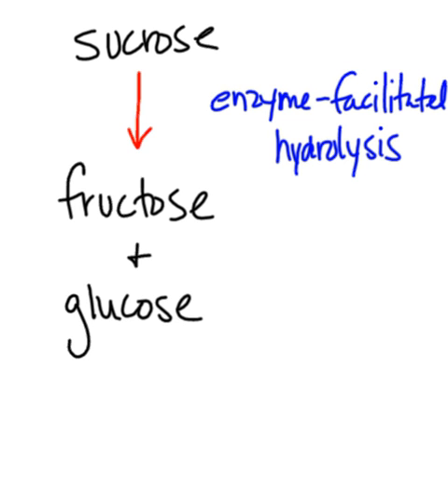You're going to have some tubes, okay? And in those tubes, you're going to have yeast and you're going to have sucrose. You're probably going to have a control, okay? And we'll go over what your lab itself is going to look like. But the background of it, you have sucrose. It is a dimer, right? It's a disaccharide that's composed of fructose and glucose, okay?